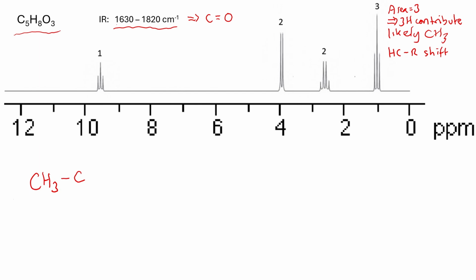But the thing that really makes the key to now connecting to the rest of the structure is the splitting. So don't ignore the splittings, because they're actually usually the most informative thing that you've got to work with.